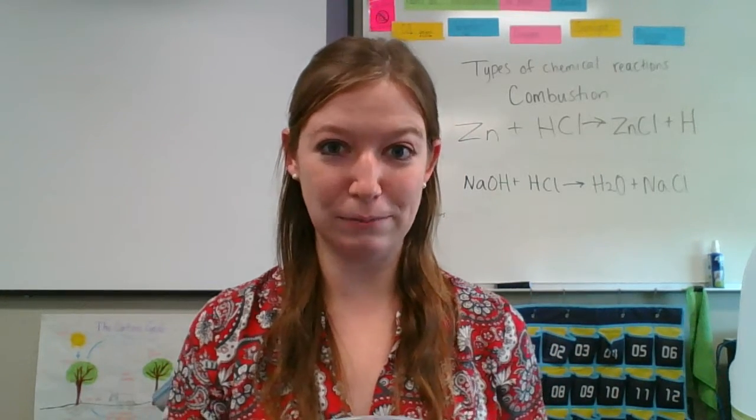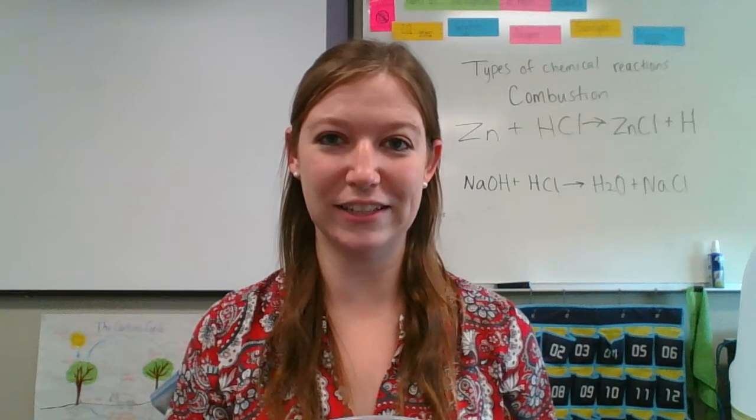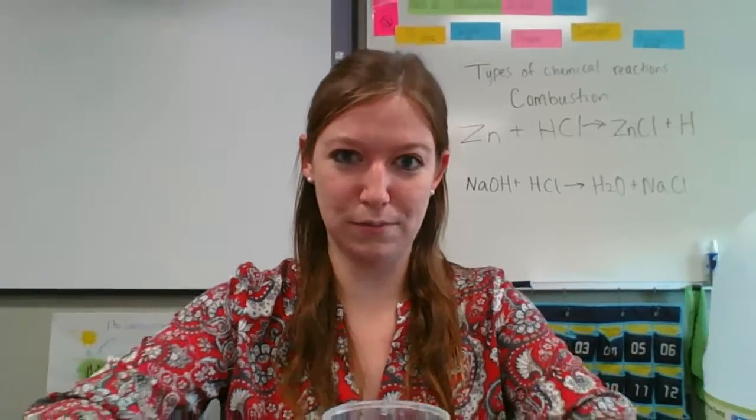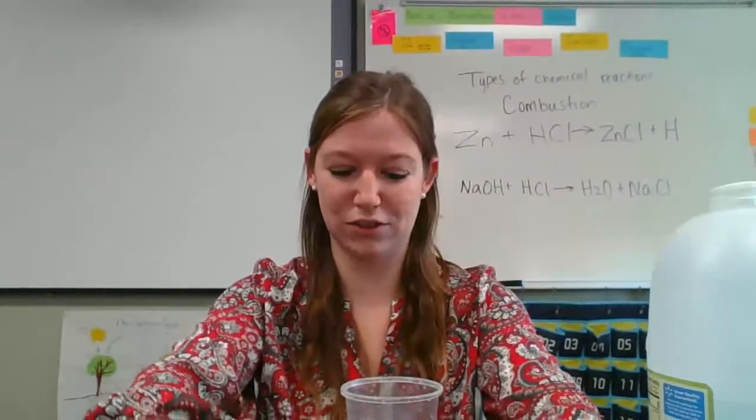So in this video, I'm just going to show you the demos that we showed in class, okay? So for synthesis, whenever we're creating something new, I have this particular reaction. I'm going to add the classic vinegar and baking soda together. So you can do this reaction at home. I'm going to scoot my computer away so that you can see certain things.